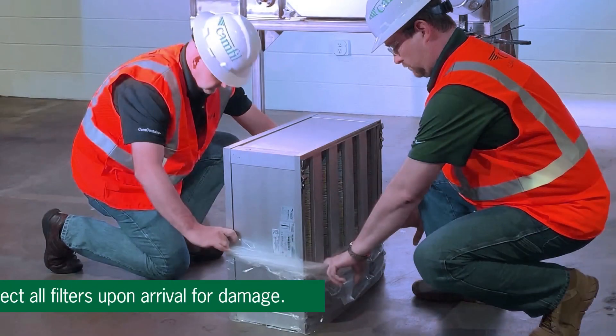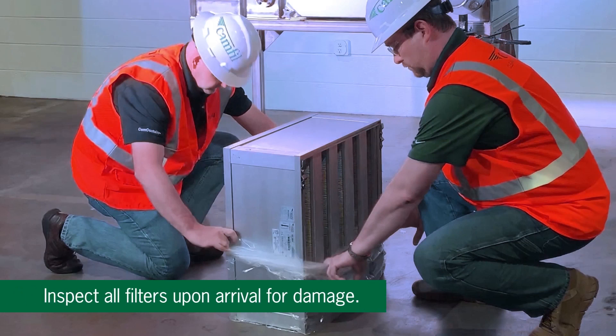Inspect all filters upon arrival for damage. If necessary, replace those that are damaged. Then schedule the filter installation or change-out with the owner's safety officer.